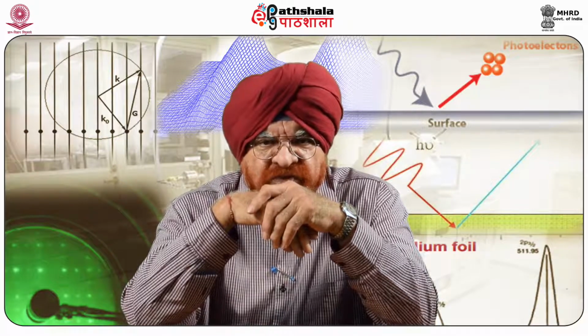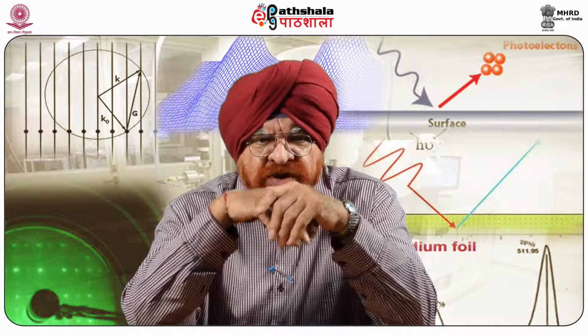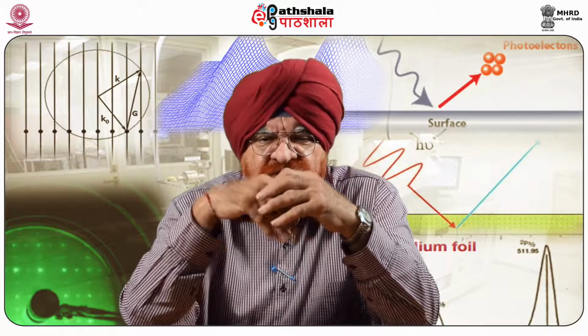Compared with optical interferometric microscopes, optical profilers, the AFM provides an unambiguous measurement of the step heights independent of reflective differences.